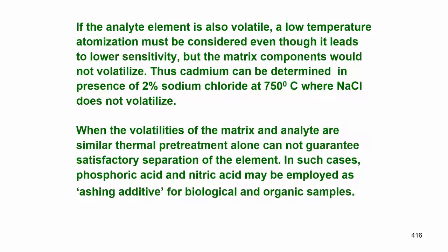They are much more easily removed than the chlorides and sulfates. Okay. So, if there is a problem of equal volatility, consider addition of phosphoric acid and nitric acid to remove the components more volatile than the analyte.